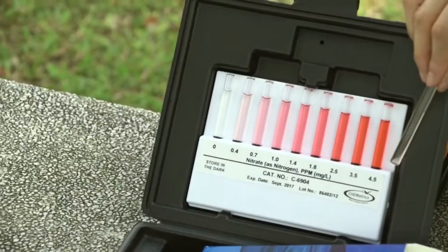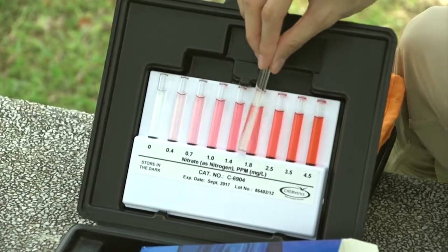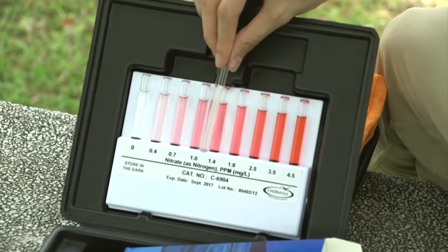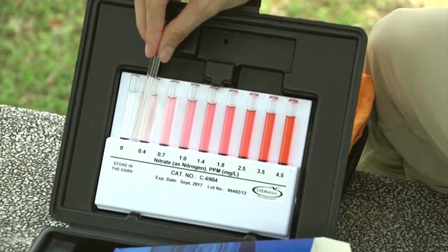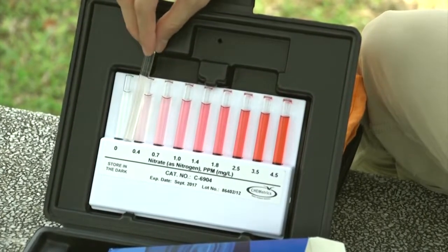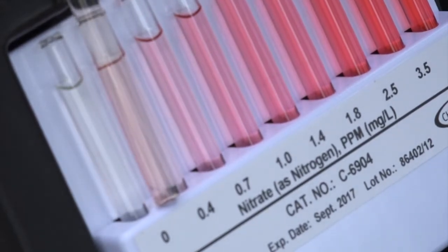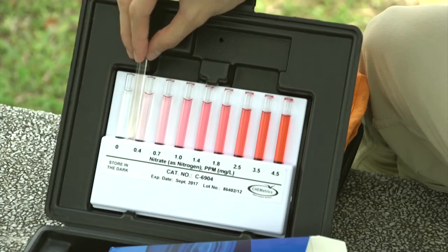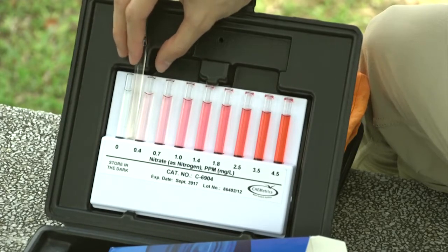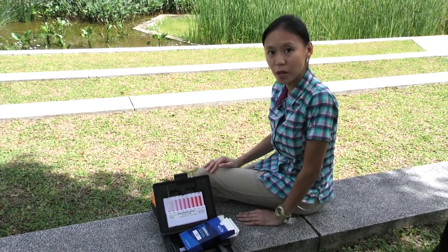Place the ampule between the colour standards, moving it along the comparator until the best colour match can be found. If the colour of the sample falls in between the standards, it is okay to estimate the sample value. In this case, you can see that the concentration would be about 0.1 milligrams per litre. To convert to milligrams per litre nitrate, multiply that result by 4.4. Make sure that you collect and dispose of all water used in the testing to the chemistry department of your school.